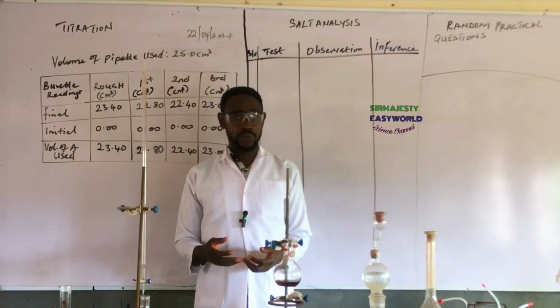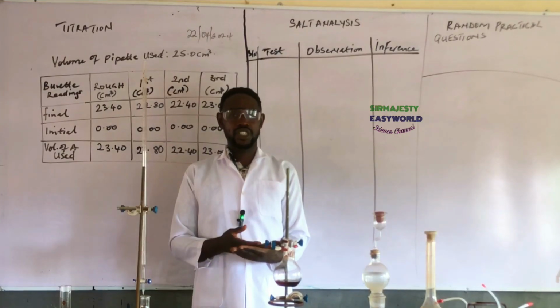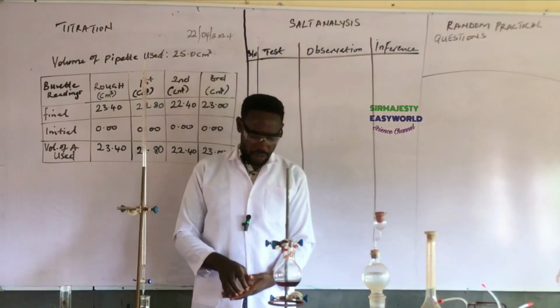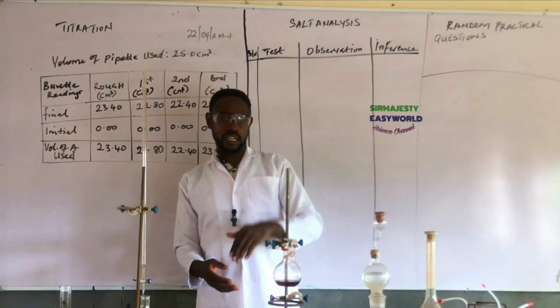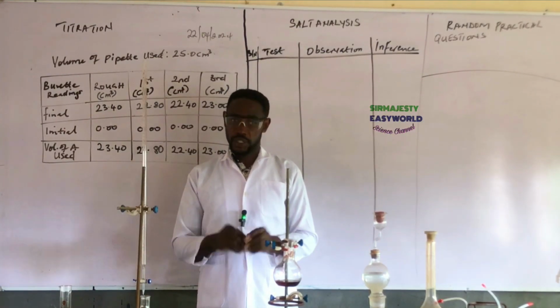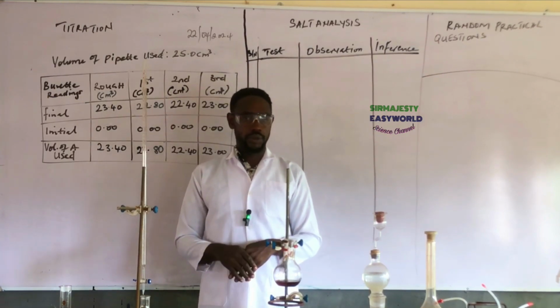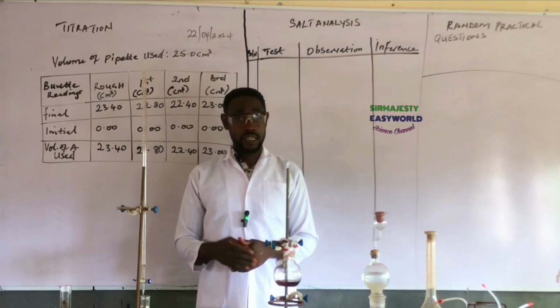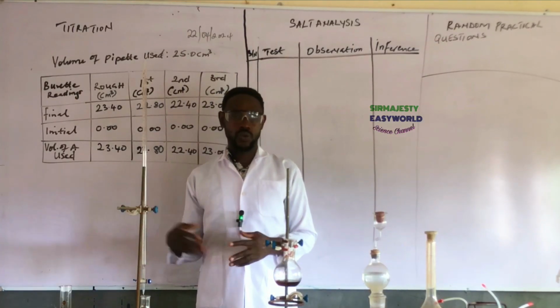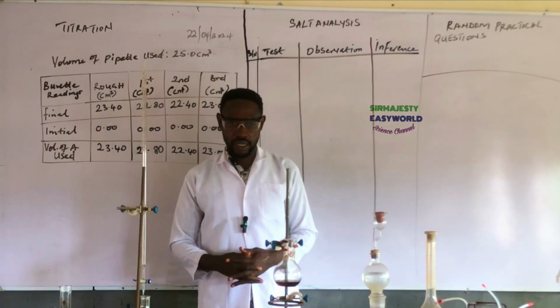In biology, we can have specimen J, and the name must not start with J. It's just a way of identifying specimen, because they are telling you here to put A in a burette. So what am I trying to say? In your practical, especially chemistry teachers, don't assume that A must be in burette. You can check 2019 and, I think, last 2 years or 2022, when iodine and the sodium thiosulfate were titrated.